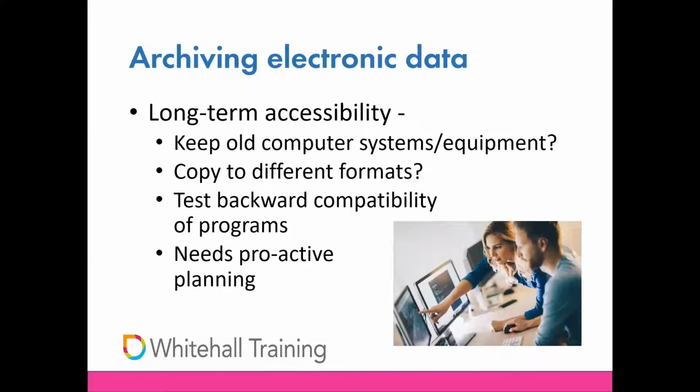And even when they are, keeping systems up to date can also be incredibly expensive. So these are all challenges you need to bear in mind. When the data is migrated from place to place in the course of archiving or system upgrades, there needs to be proactive planning and QC processes in place.